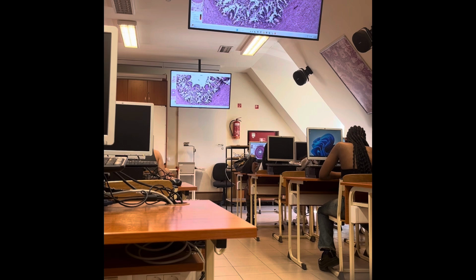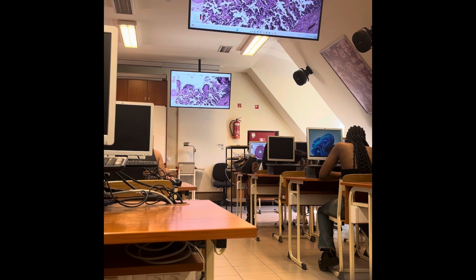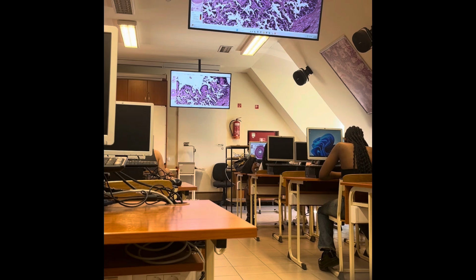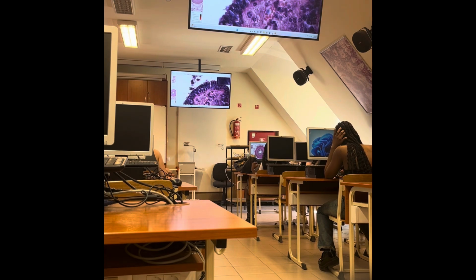Okay, so then let's focus on it. Unfortunately, in some parts, the epithelium is disrupted. I think that is due to the section preparation procedure, so it's an artifact that epithelial layers are detaching from the surface. So the folds have a fold of the lamina propria and epithelial lining. We can see here what type of epithelium.